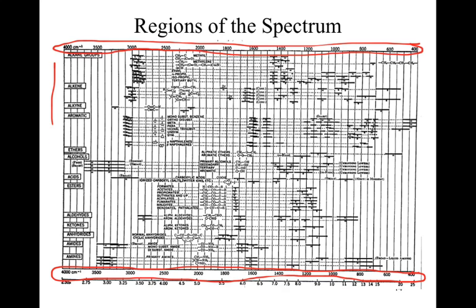Along the side, what they're trying to show is they're classifying things according to individual functional groups. So for instance, if we take a look at the alkenes, because they're hopefully a little bit easier for me to highlight, our alkenes are known to have signals wherever we see those solid lines.